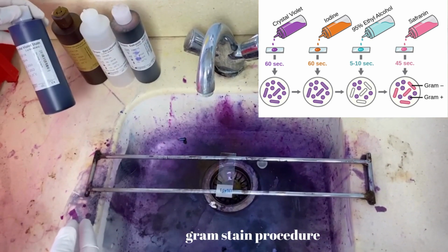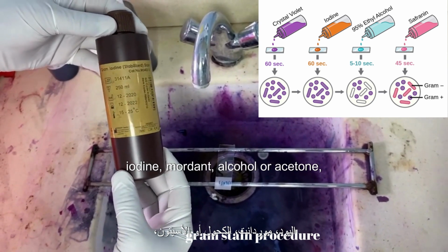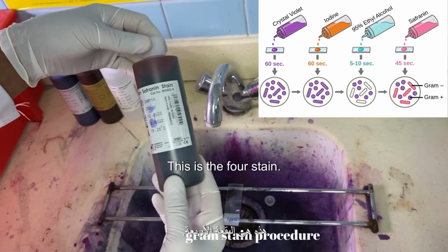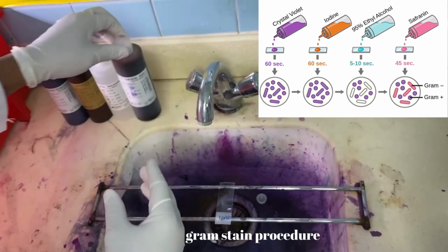Crystal violet, this is the primary stain. Gram's iodine, the mordant. Alcohol or acetone, the decolorizer. And safranin, this is the counter stain. These are the 4 stains in the gram stain. We can go to step 1.